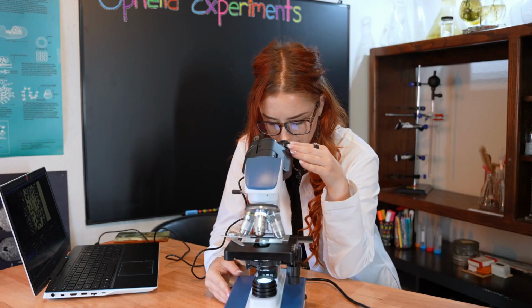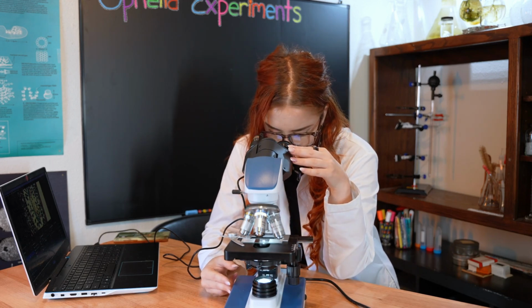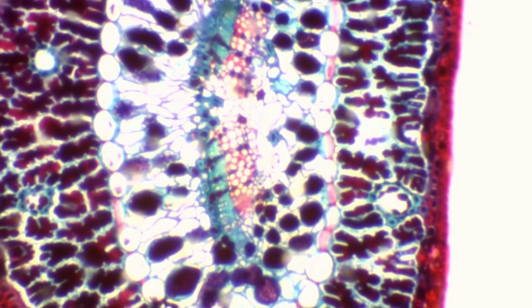So pine leaves differ in their stomata from other plant leaves, basically because they have what are called sunken stomata. So basically it has tinier pores for gas exchange. Let's see if we can take a closer look at that.